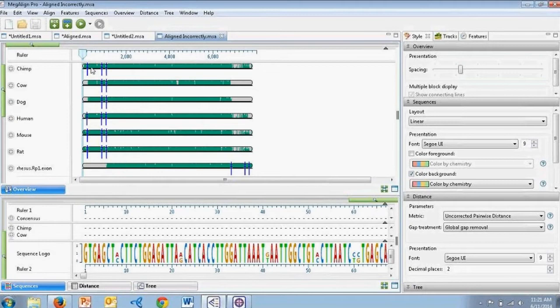What we can see here for all of these sequences is that the longest segment is here on the right, and at the furthermost right side we have this large gappy section. However, for the rhesus example, where we arranged this in a different order, we can see that the longest segment is on the left, as well as the longest gapped region.